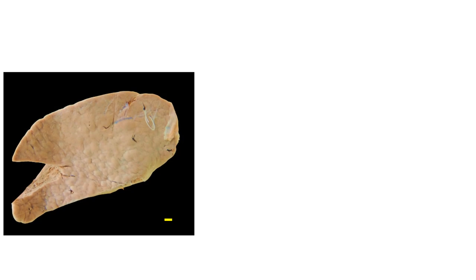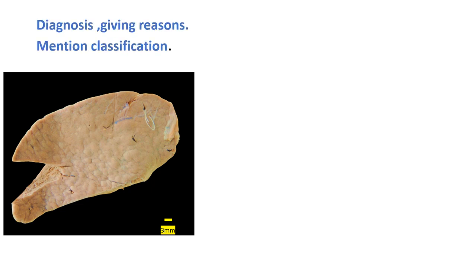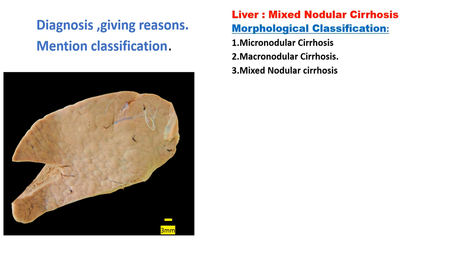This is another slice showing similar features of large and small nodules — some smaller than 3 mm and some larger than 3 mm. There is an original thread from the museum specimen which could not be removed. The question asks for diagnosis with reasons and classification of cirrhosis. This is again a case of mixed nodular cirrhosis.